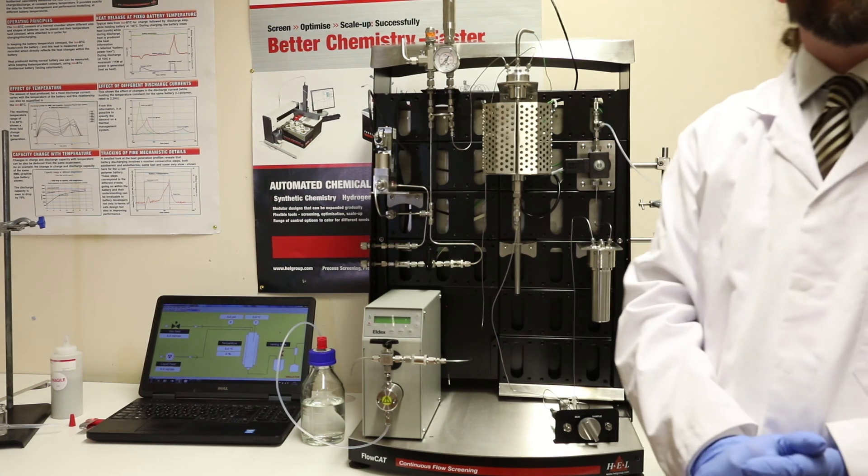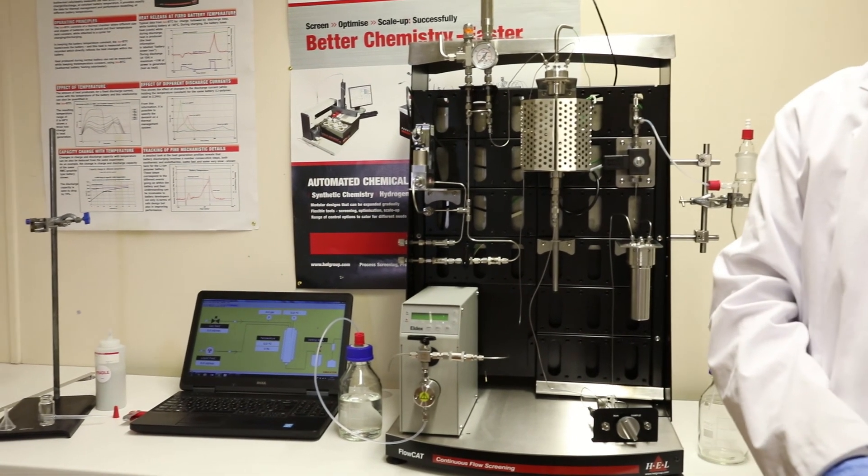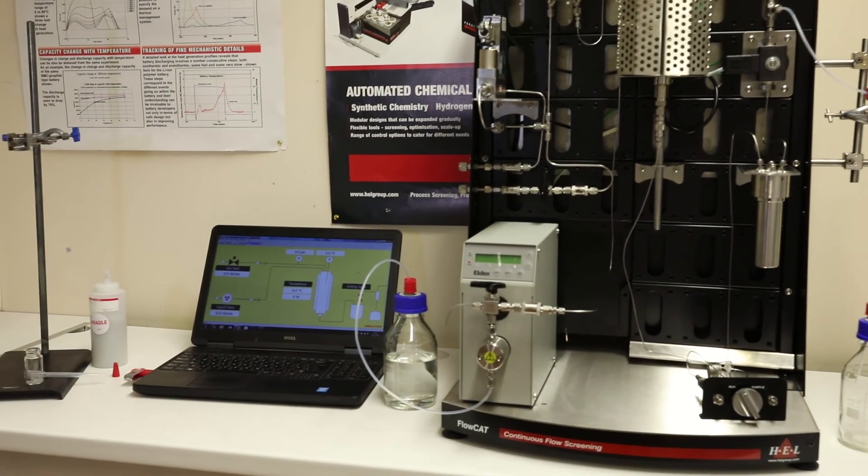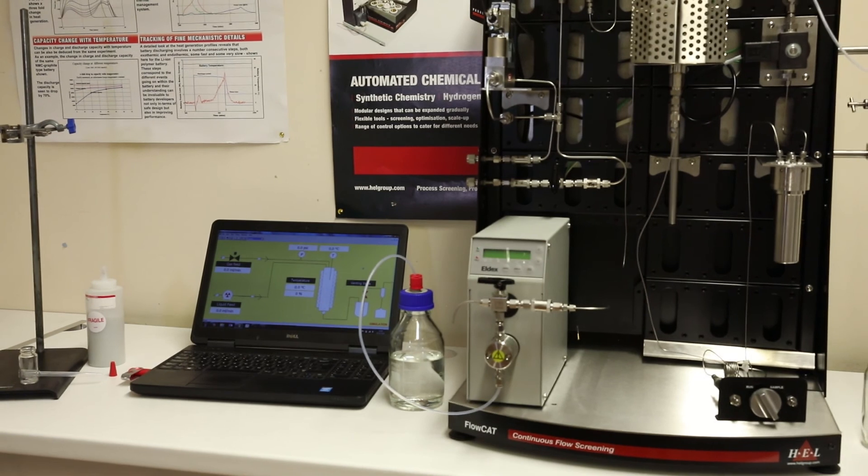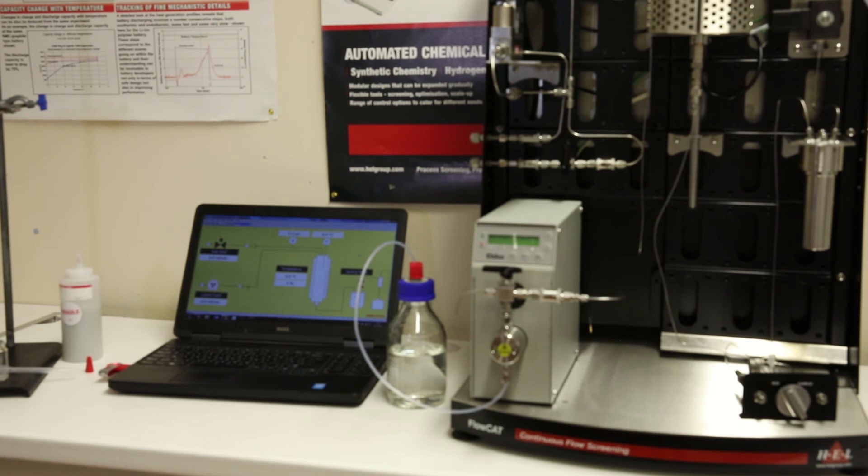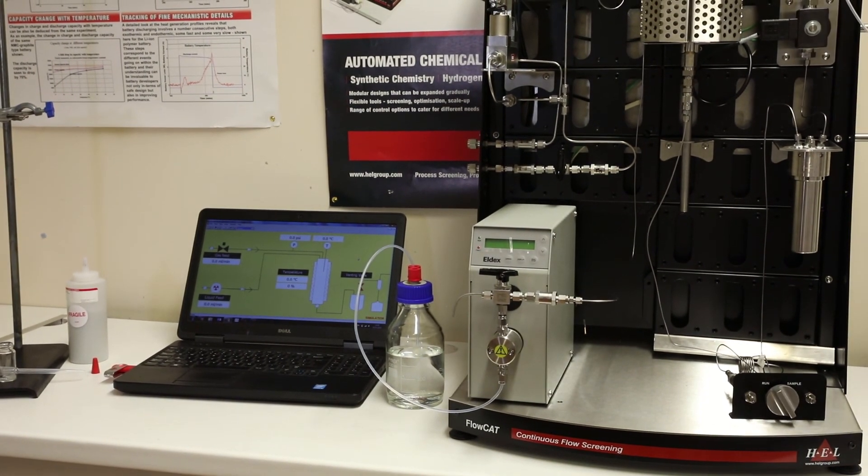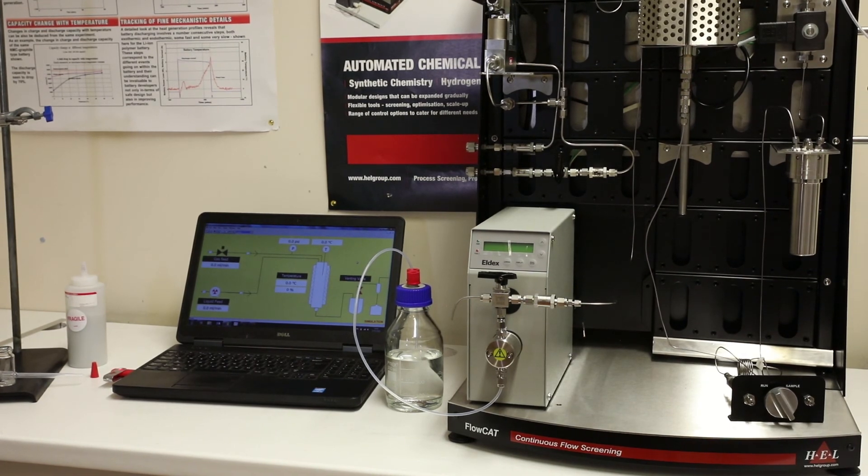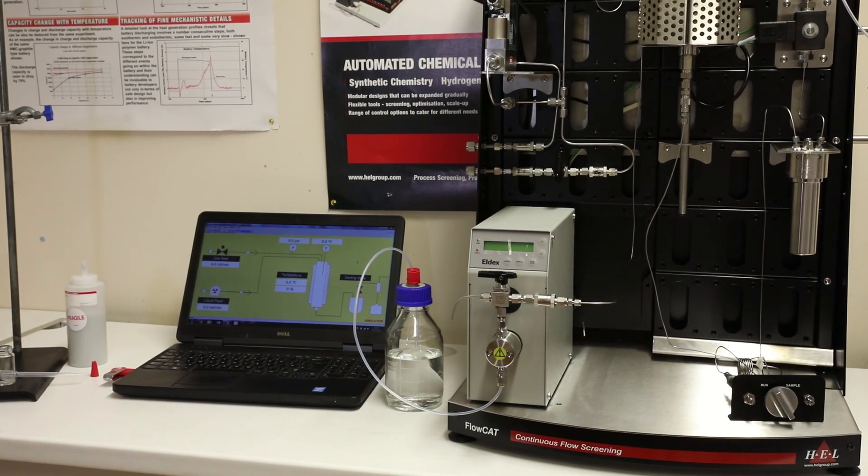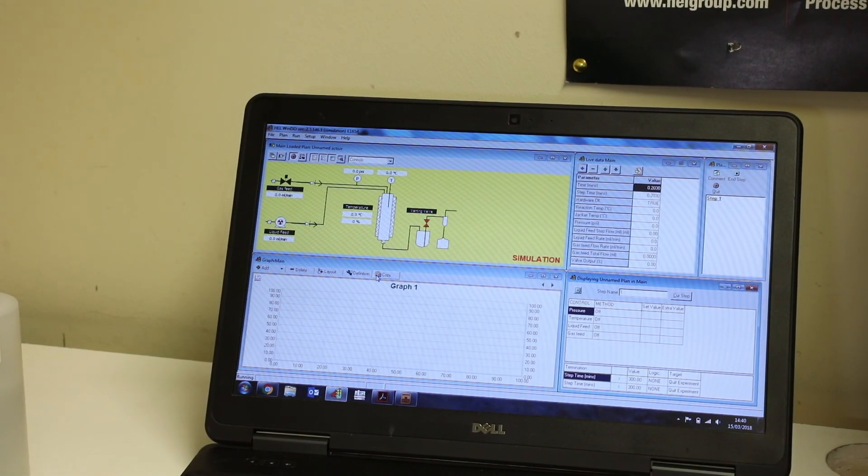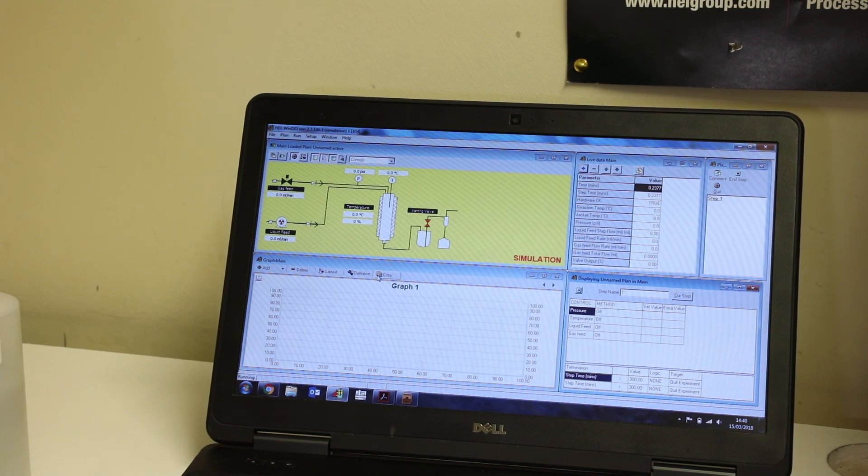Sitting above all of this is our WinISO control software. The WinISO software incorporates modules which can trigger safety shutdowns based upon any variable on the system. So you can set a shutdown temperature, a shutdown pressure, a shutdown flow rate, even a shutdown difference between the jacket and the reactor bed temperature. So if you see the reactor bed suddenly go up in temperature when you're not heating, you know there's an exotherm and you want to kill the flows. The system is fully controlled by our WinISO software which allows you to write recipes and methods which the computer will run automatically and the system can be operated fully unattended.